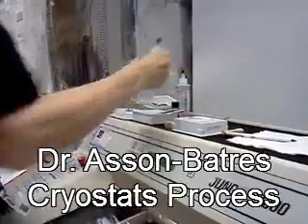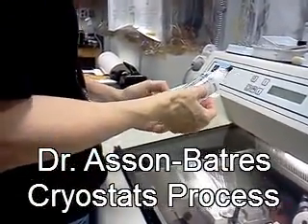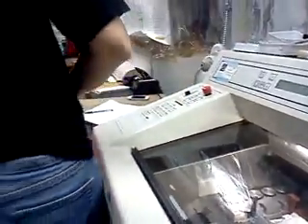All right, so now we're going to finally move to what we're doing. Now this stuff is the OCT I was telling you about, an OCT compound. It's made by Tissue Tech, and this is the product number. You can get it at any time you want, okay?